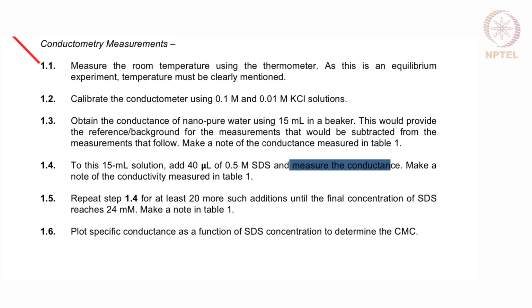Once having done that, you're going to have a measurement that looks like this, where you're going to have a certain curve until here, and then that slope ends up changing after a point. This is of course concentration versus conductivity. So what ends up happening at this position, this value of concentration is when you start forming the micelle.